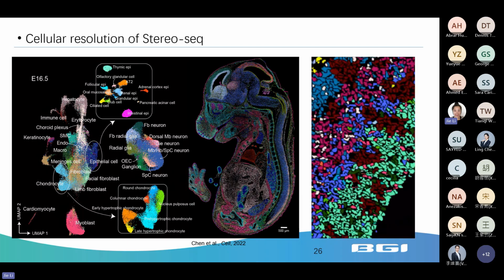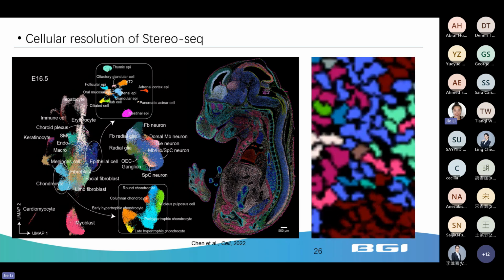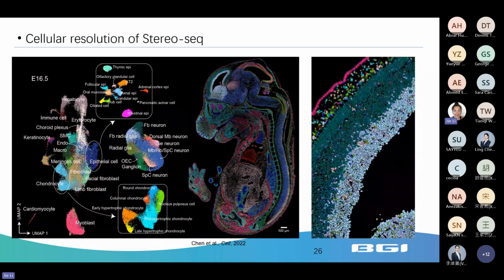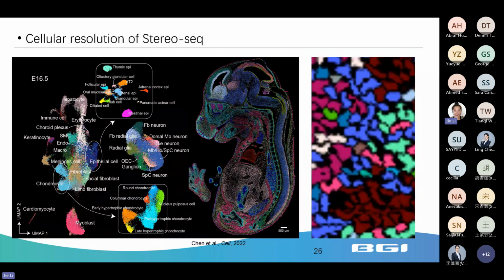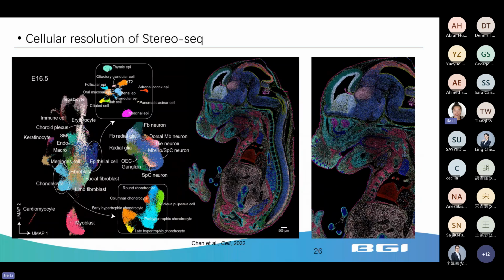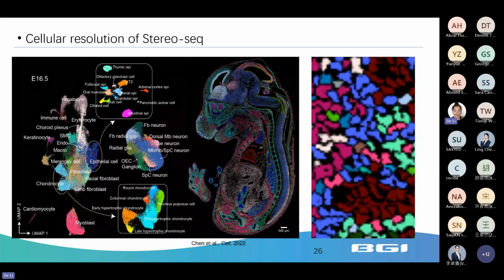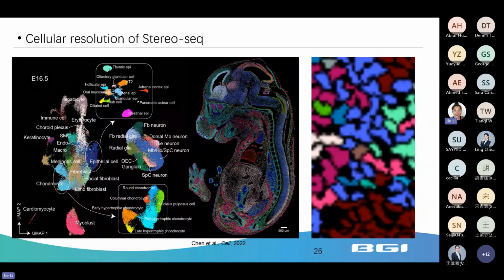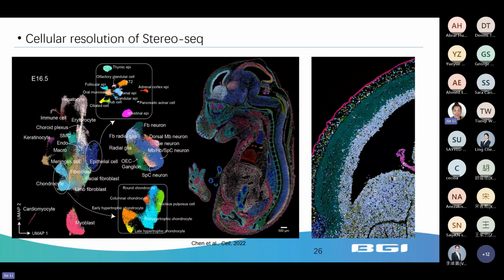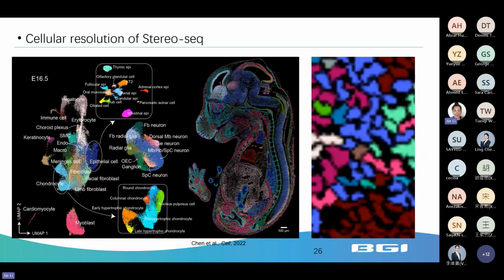So during the tissue development, the researchers performed image-based single-cell segmentation on the 16.5 days mouse embryo, and they filtered out cells with low capture rates and obtained more than 281 thousand cells with an average of over 1,100 UMI, also called MIDs, and 529 genes per cell.